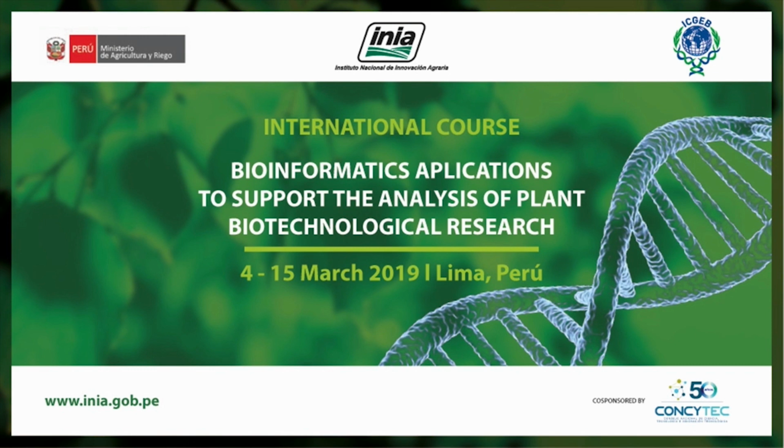Output. Yep. Yeah, excellent. You probably want Clustal. It says Clustal Omega. This is the one. You can do it here. You can go to Wikipedia. You can go to Biostar, different output from Clustal Omega.